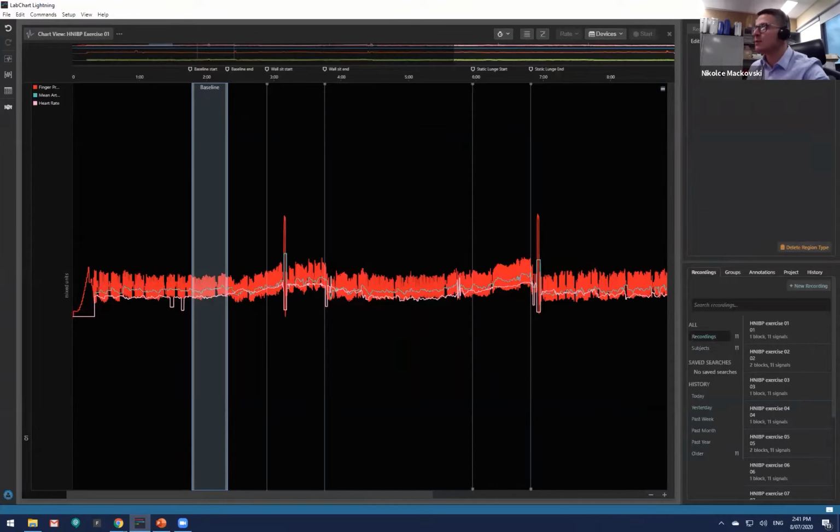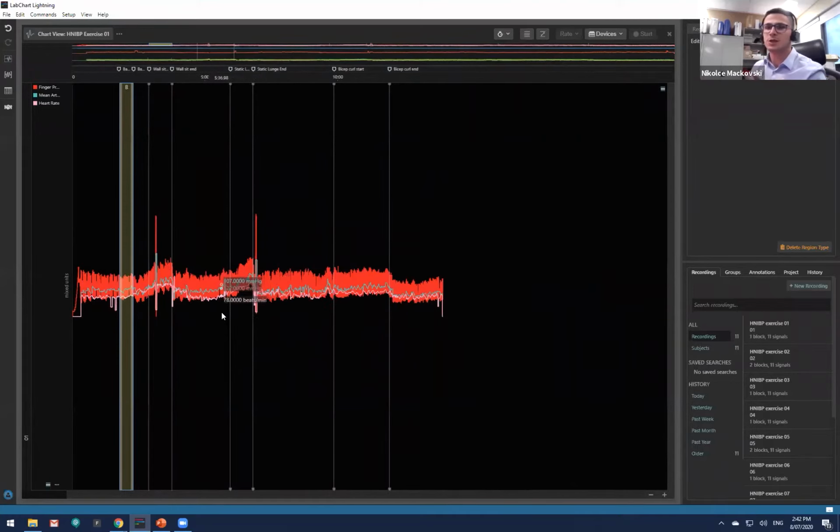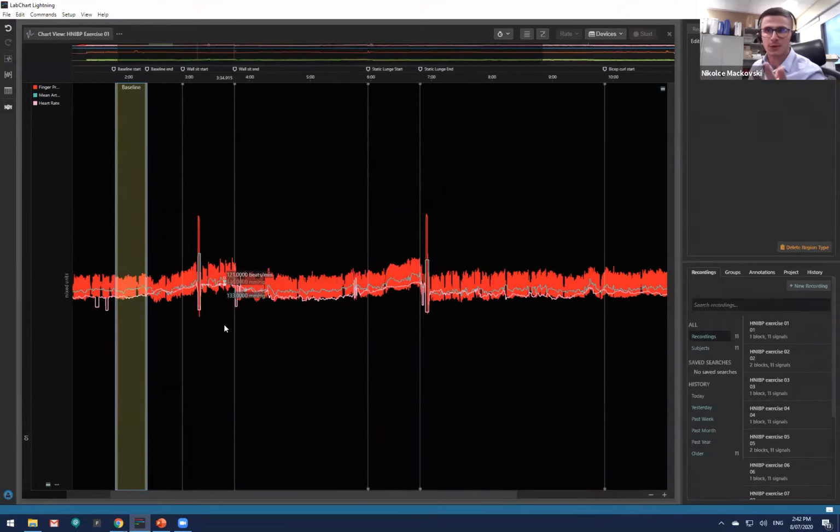So the color is actually similar to what we have with the comments, or the annotations, in that instead of having blue, you can actually change this to any color you like. So for example, if I want to change this to yellow, I can do that. So that's handy if you have a lot of different regions. If you really zoom out on a file, it's really eye-catching when you have different colors. So it just helps you look for a particular region. So you can do that if you like.